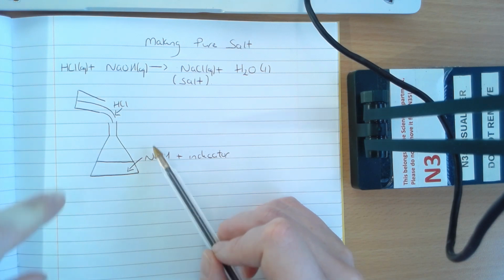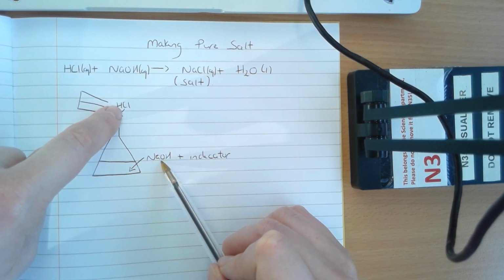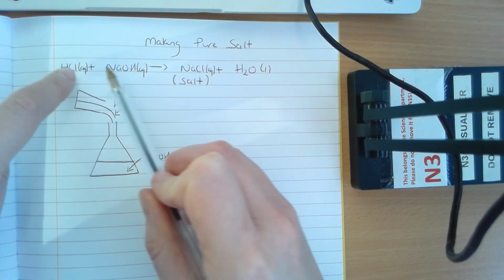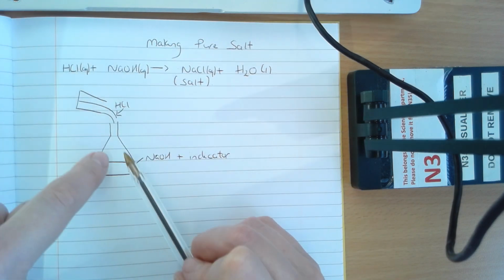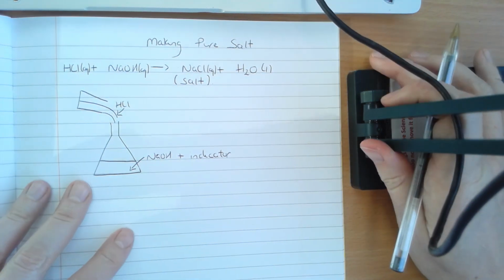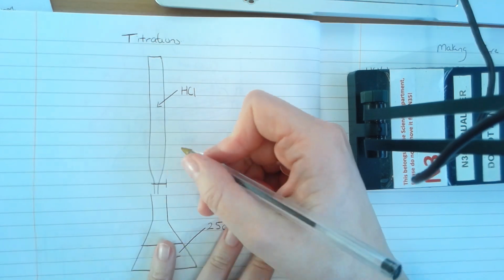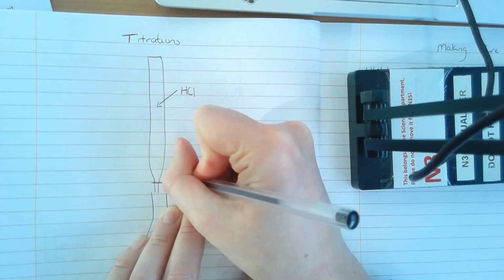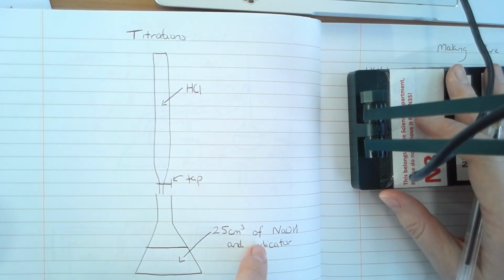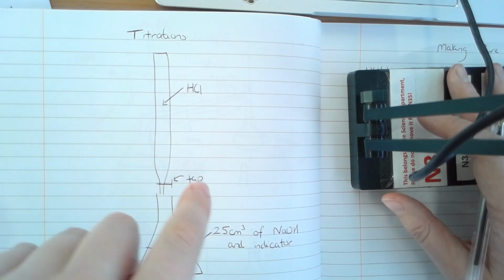Okay, so what you'll end up with if you add excess HCl is the NaOH will have fully reacted, it won't be there anymore, and you will have sodium chloride and you will have water, but that extra HCl you added will remain in the flask and you won't have a pure salt. The advantage of the burette, which is what we use in the titration, advantage number one, is it's got a tap, and that tap will allow you to add your solution dropwise when you get close to the end point and prevent you from adding too much HCl. So it gives you control.